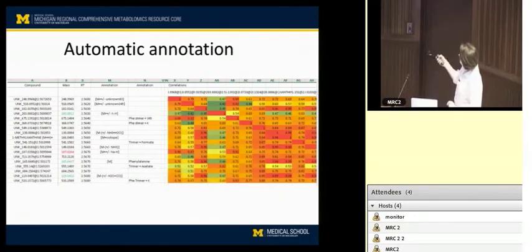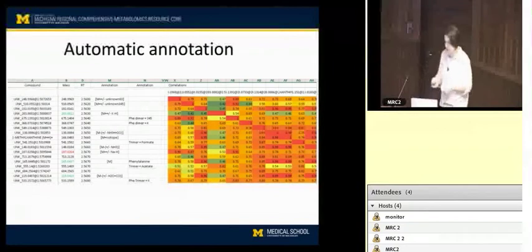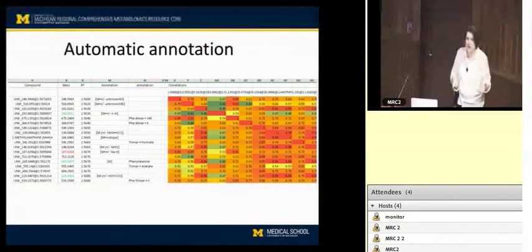So again, we took all of this data and reduced it down to one molecular ion, which is phenylalanine. You could ask whether you would rather add that all up, or get rid of everything and keep one representative ion. I guess that depends a little on the intensity and the RSD of that compound to begin with. If it's very good, then probably just retain that one peak in the first place.